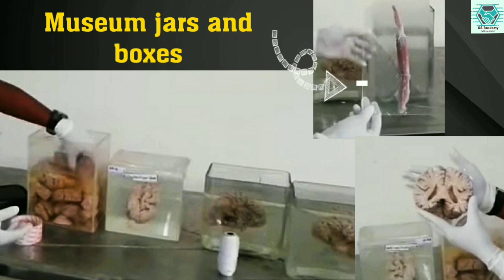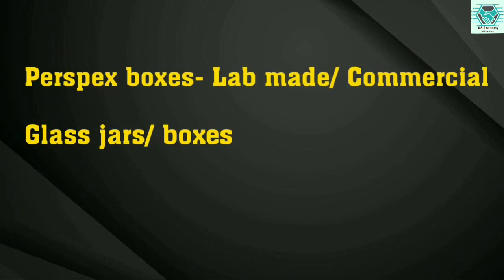On the plate, the specimen is placed in proper anatomical position, according to which part of the particular organ we want to show. Stitch the specimen to the center plate with nylon or linen thread. The center plate with the specimen is next fixed in the box. In a particular specimen, we can show it according to the view we want to show.